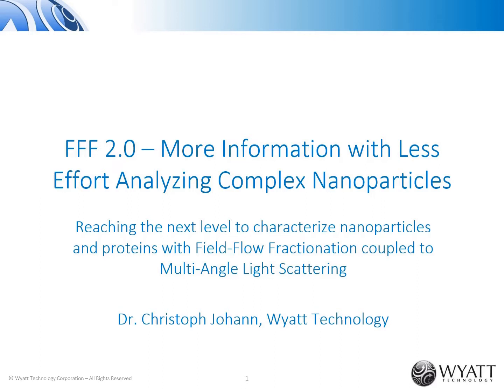I will discuss exclusively Flow-FFF today because in the family of FFF methods, this is the most universal and widely used. 90+% of FFF systems are Flow-FFF systems. So for simplicity, when I say FFF, what I mean is Flow-FFF throughout this talk.